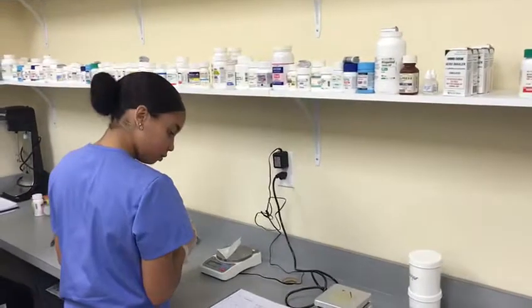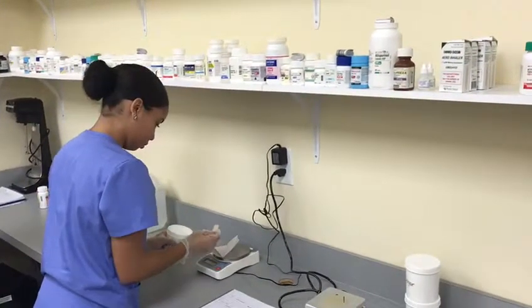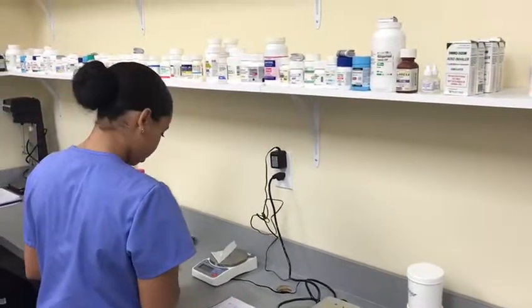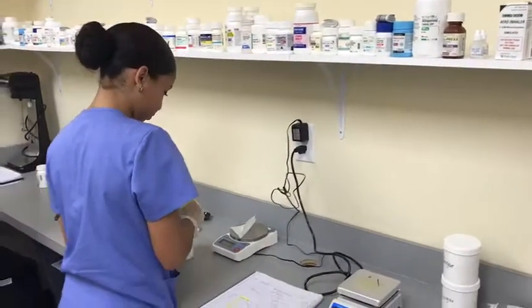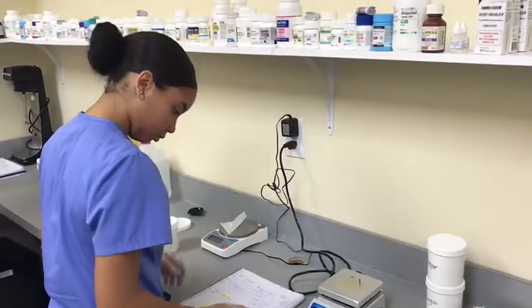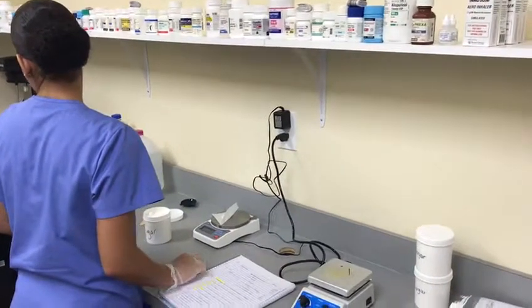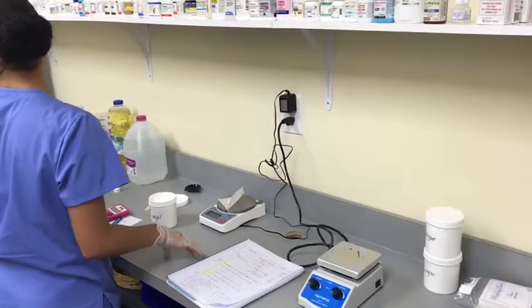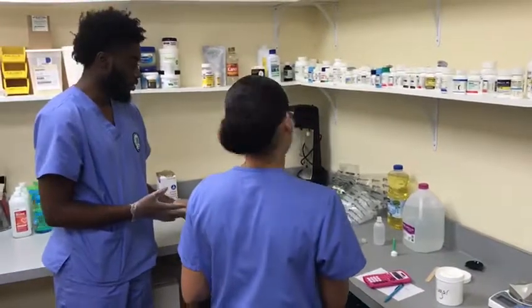We are now in the formulation stage of our compound and we have Nicole who is weighing out her two chemicals. Our chemicals are benign — we're using sugar — but as you can see she is maintaining proper technique, and she's basing her formula on the calculations that she just performed using a digital scale.